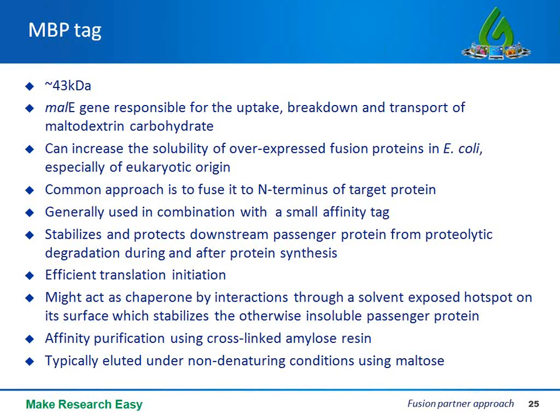Originally this was developed as a protein expression tag in the 1980s, and it's known to significantly enhance the solubility of a variety of target proteins. Now this tag is typically used at the N-terminus, but it's also effective when placed at the C-terminal end.